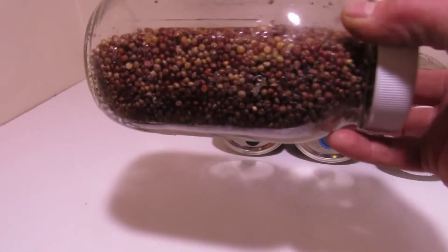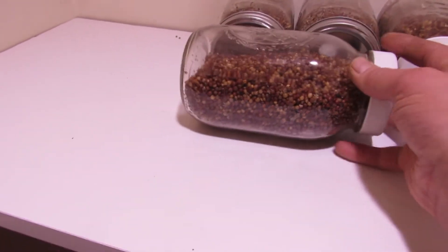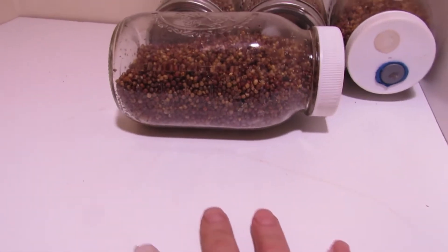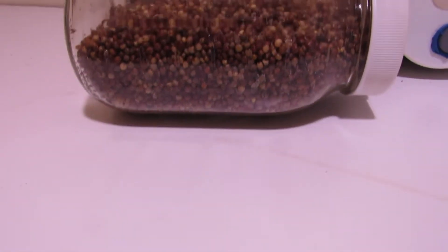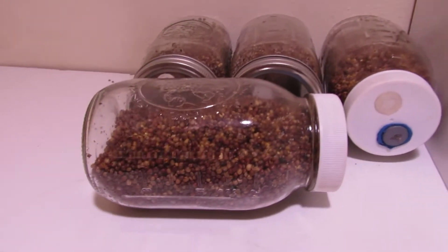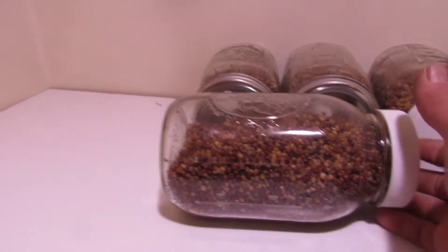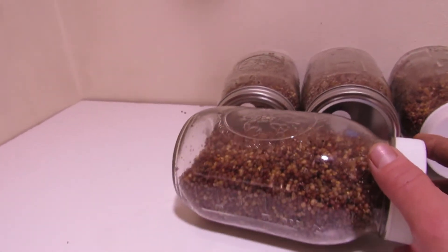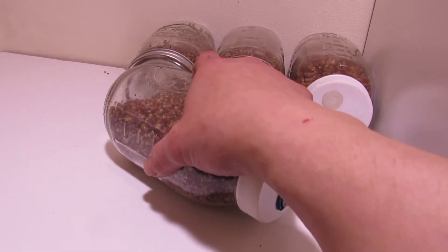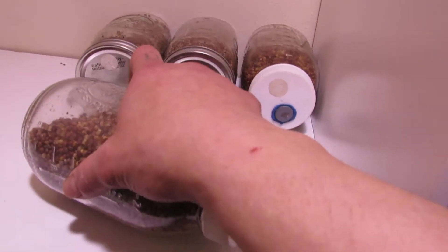This next step is not completely necessary, and it stems from an overabundance of caution, but it's something I got in the habit of doing. I noticed what was killing my jars of birdseed is when the liquid culture would pool up at the bottom. I like to leave it laying on its side like this for 24 hours. This just lets that liquid culture soak into a broader surface area, making it virtually impossible for it to ever pool up at the bottom again. But since we are going to be shaking our jars, it's not completely necessary — just something I do.